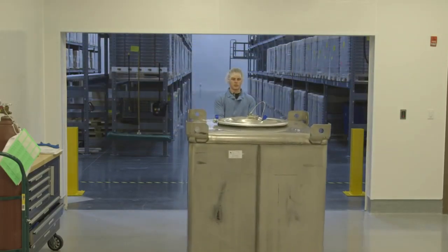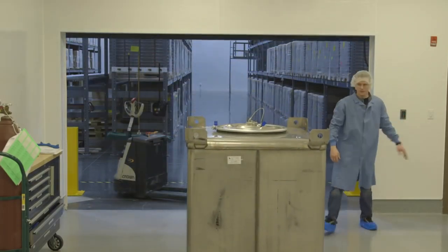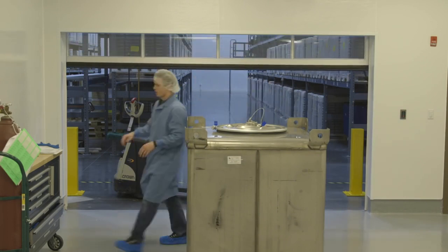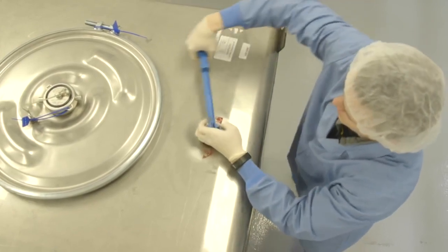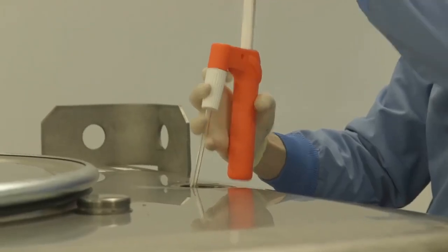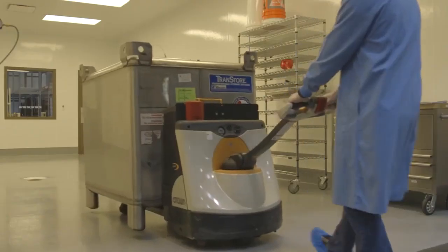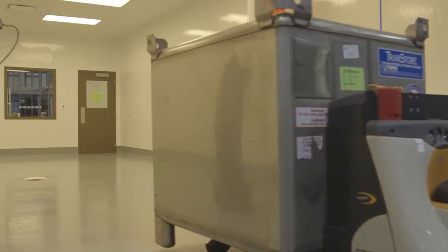The minute the oil arrives, within 24 hours, we will take that oil into a sampling room, and we will pull samples out and do various tests to check that oil and its chemical makeup against the specification that doTERRA has set to our suppliers.